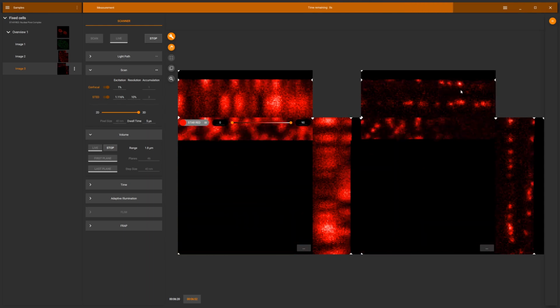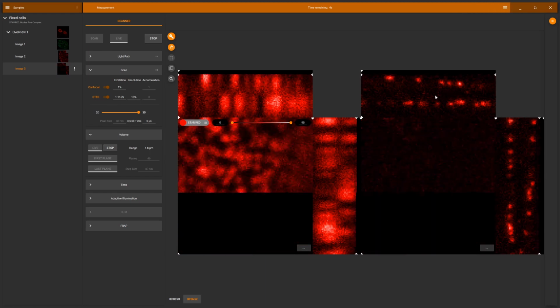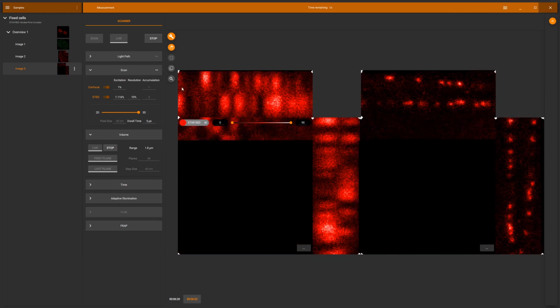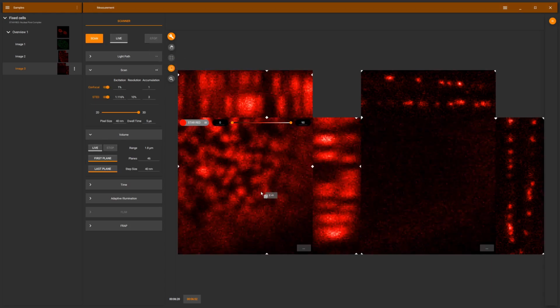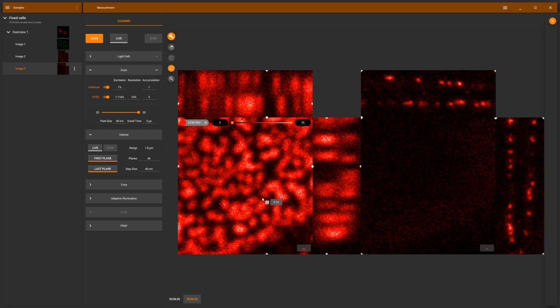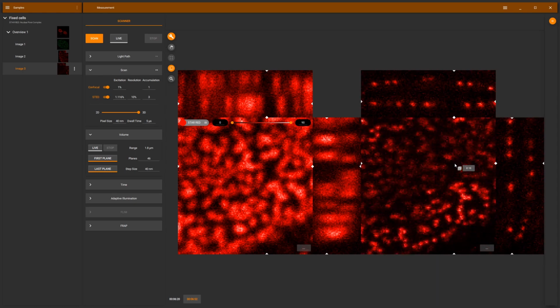Now we are in the second layer of our nucleus. So if this stack comes to an end, we can again scroll through our stacks. So here the confocal one. And now you should see the improved Z sectioning in our 3D STED stack.